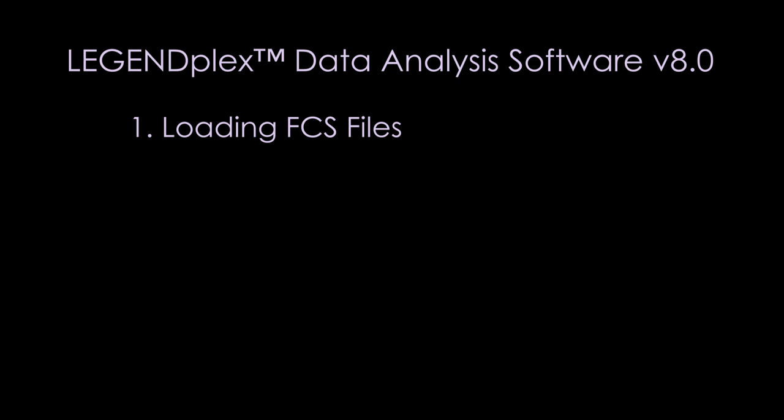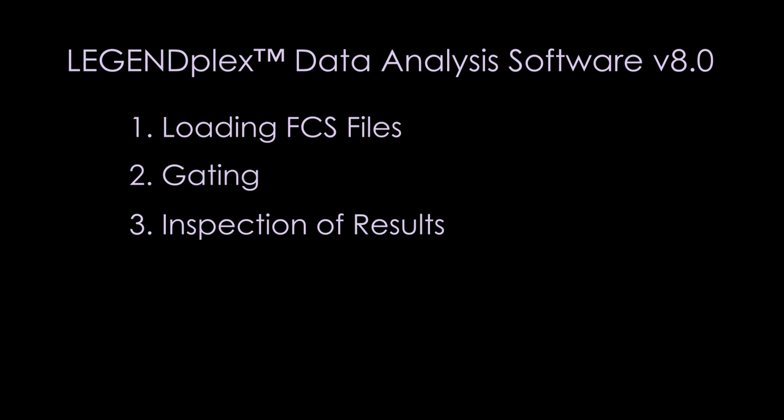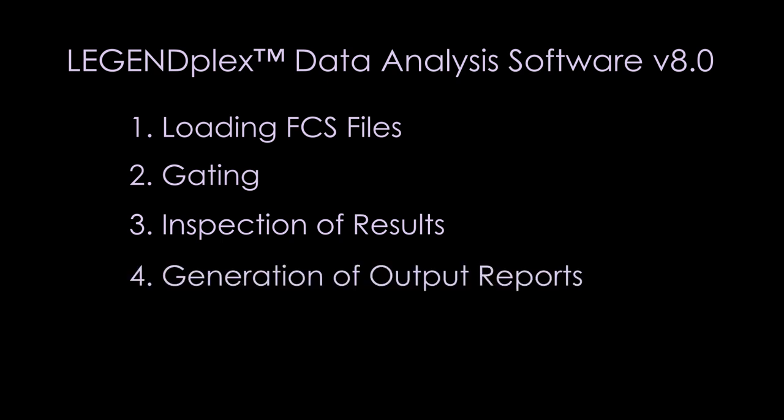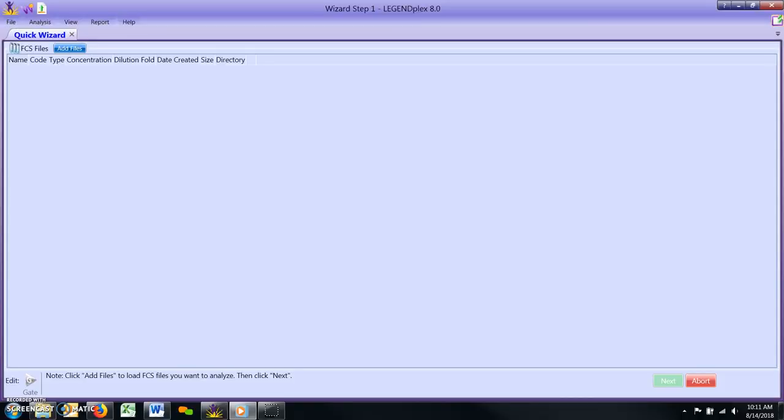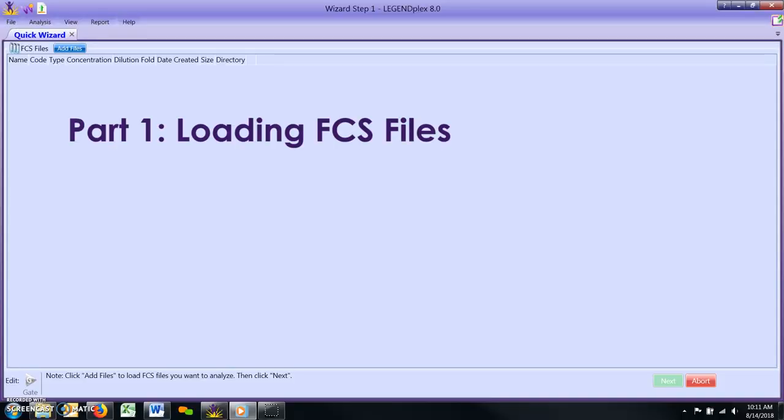1. Loading FCS files 2. Gating 3. Inspection of results 4. Generation of output reports. Part 1: Loading FCS files.